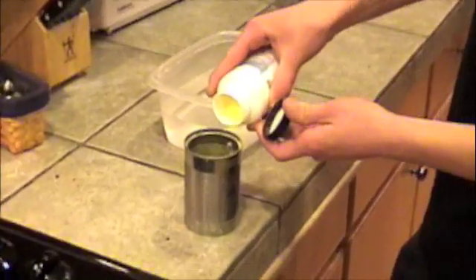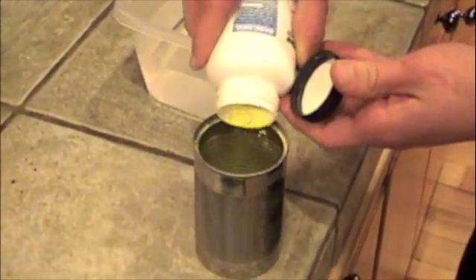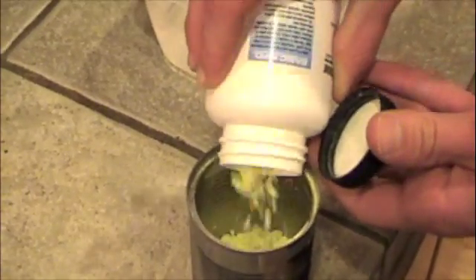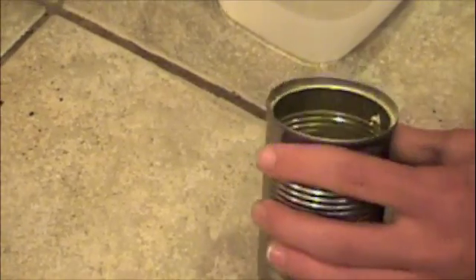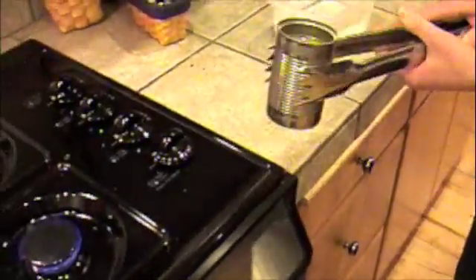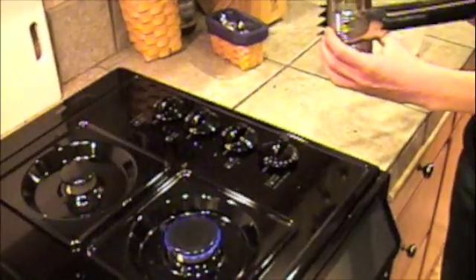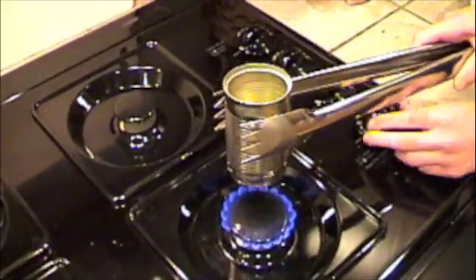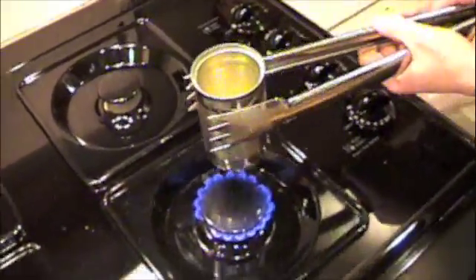In order to change the form of the sulfur — it will still be pure sulfur, but a different form — I'm going to add a little more sulfur. What I'm going to do is melt the sulfur slowly and carefully, because it's flammable, so it's kind of hard to do when you don't have a controlled temperature.